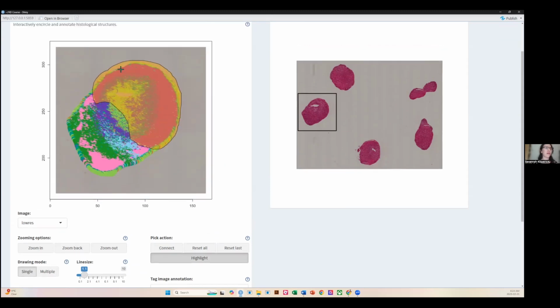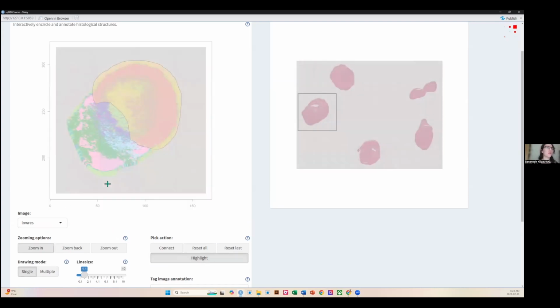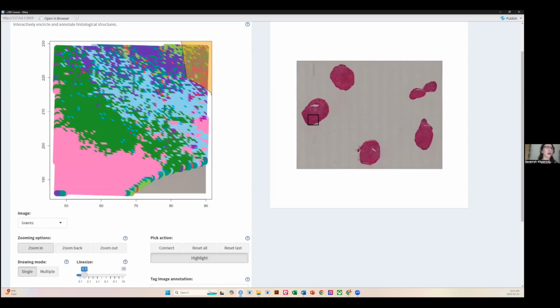So in this way, I've isolated my ventral organoid side. So this is where the MGE neurons originate from. And in that way, I'm able to only isolate, say, the few purple cells that have migrated. So these purple cells here.